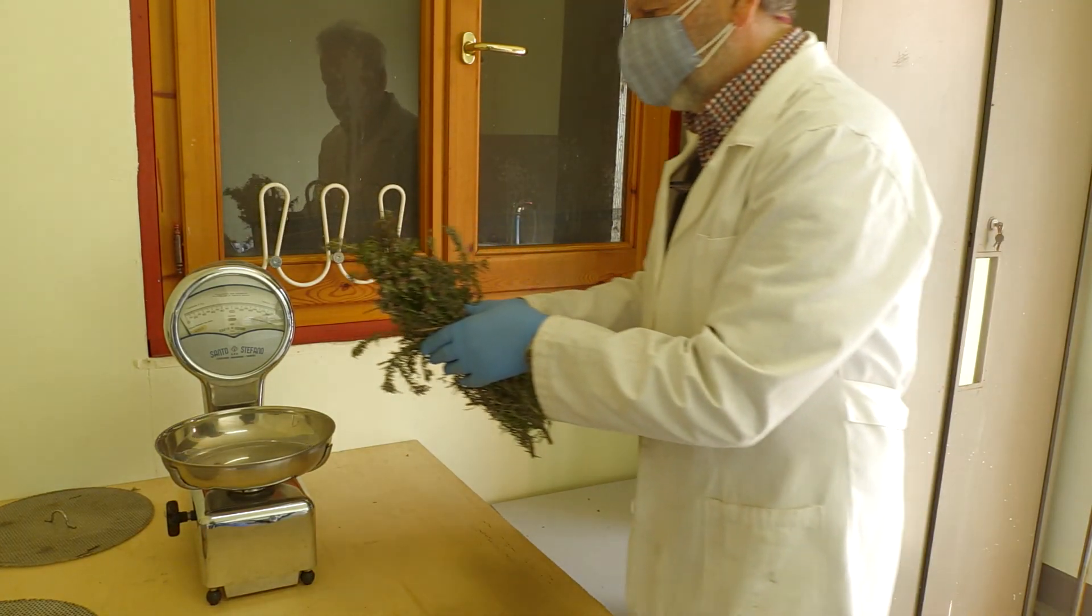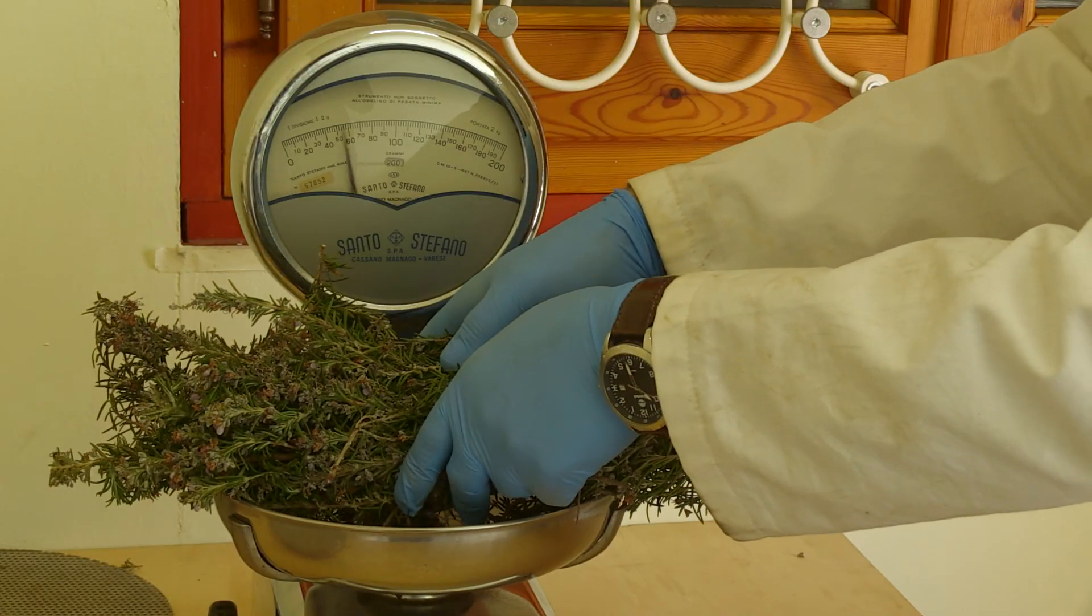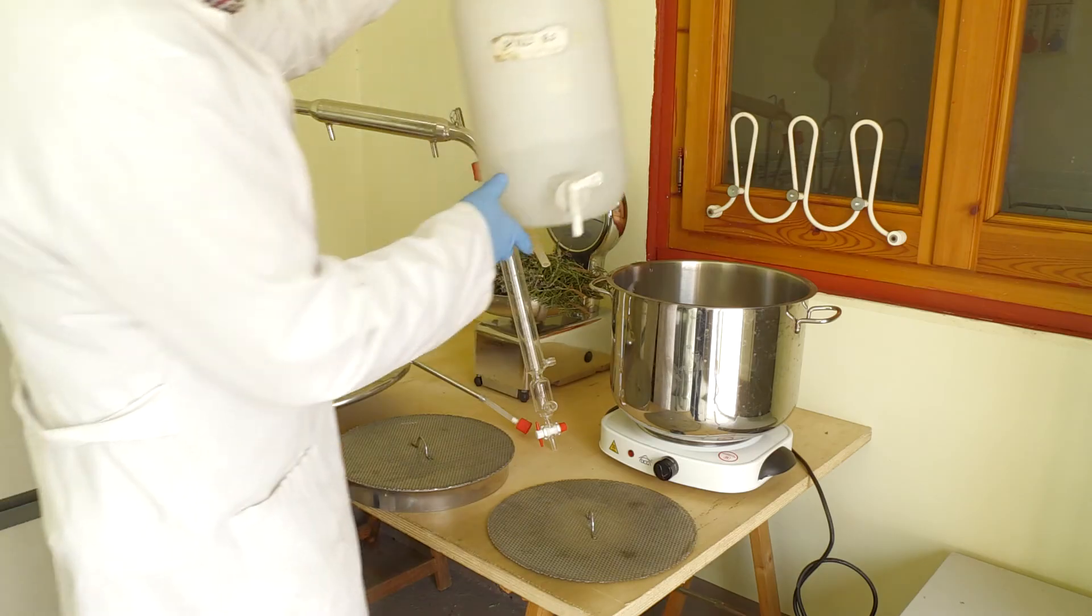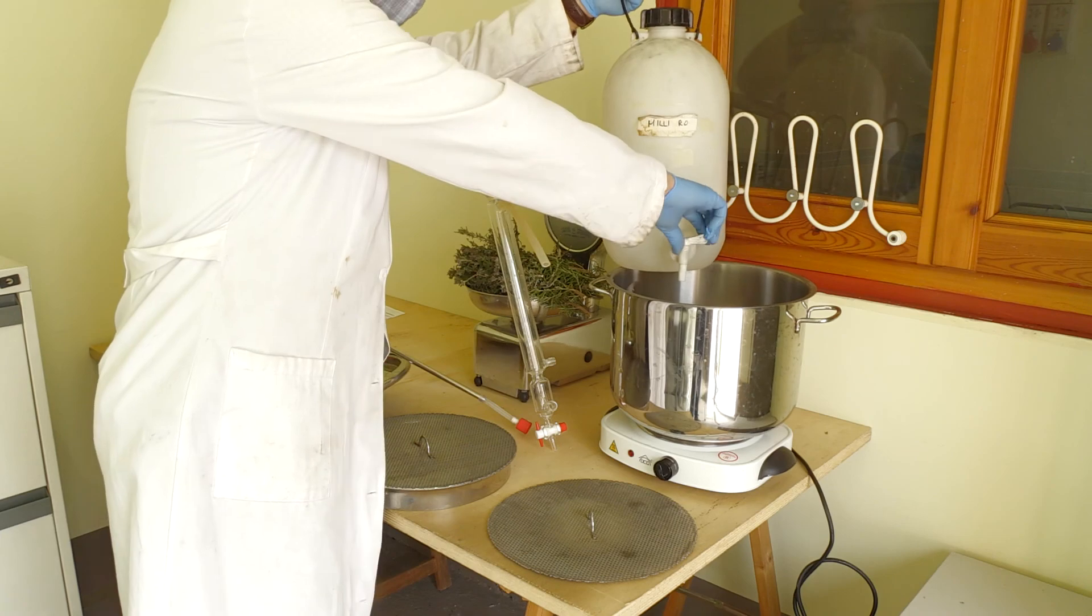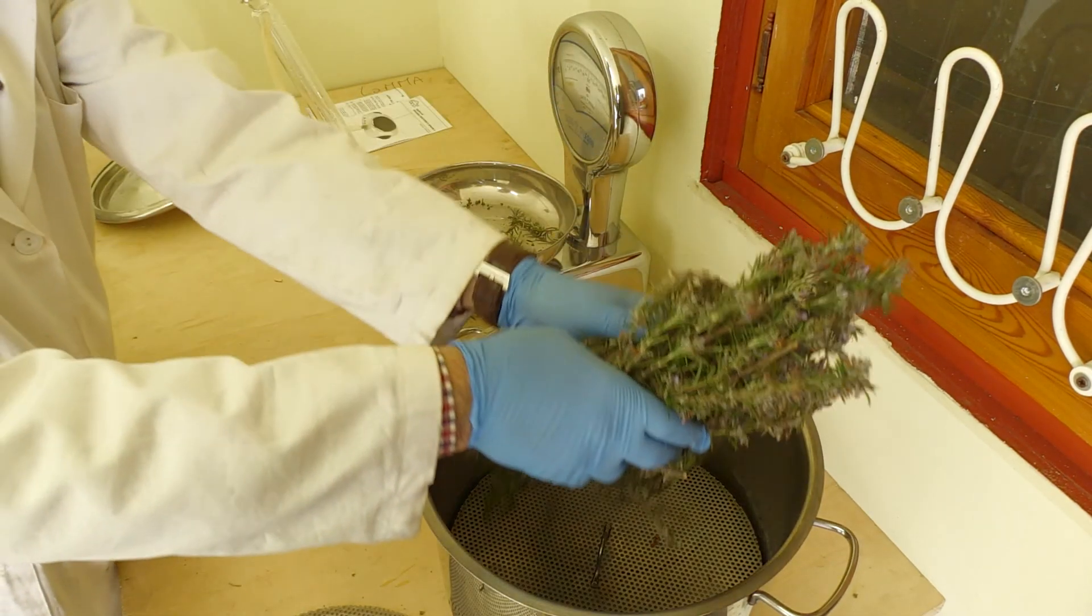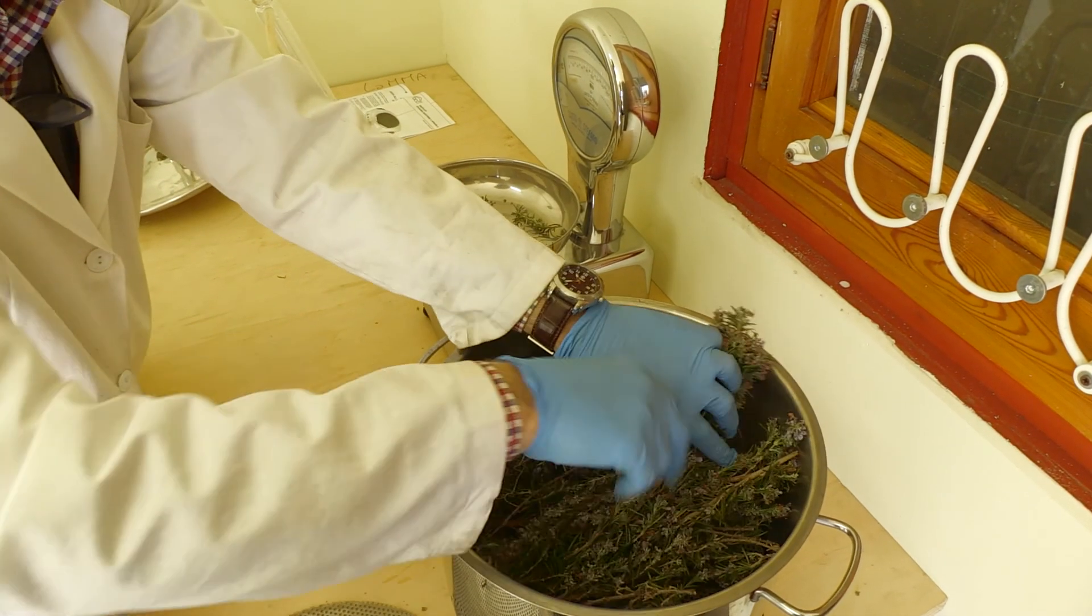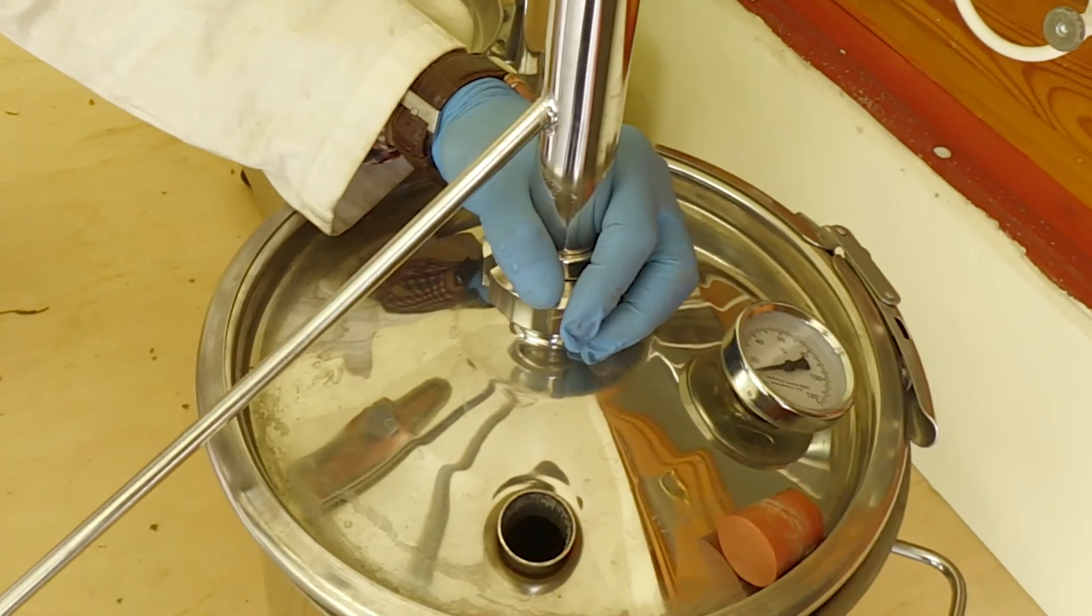The material must be weighed to estimate the extraction yield of the distillation process. After water addition, rosemary twigs are put on a grid at the bottom of the distillator and water is brought to boiling point.